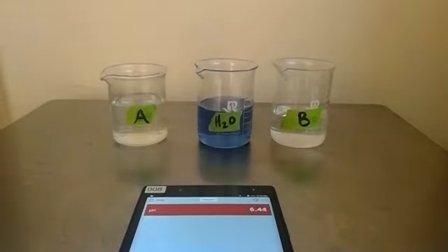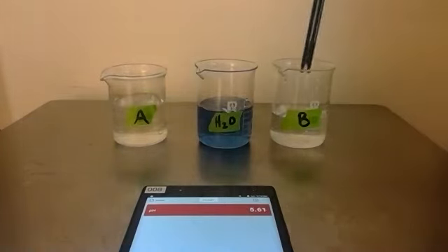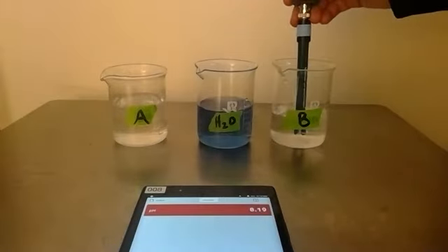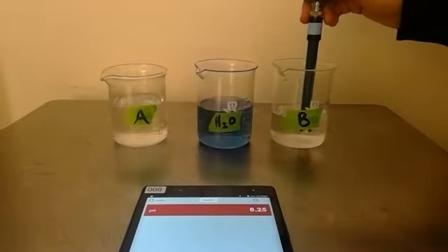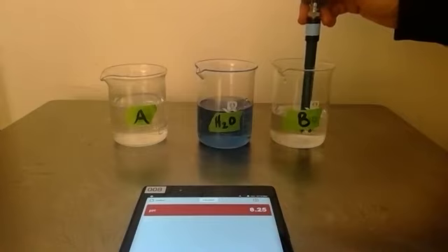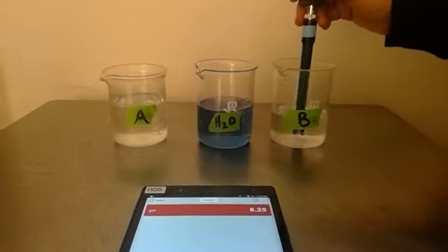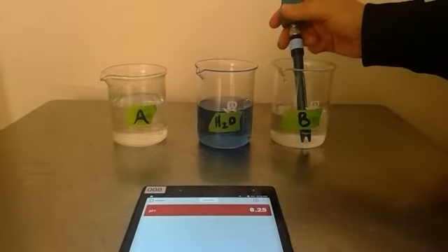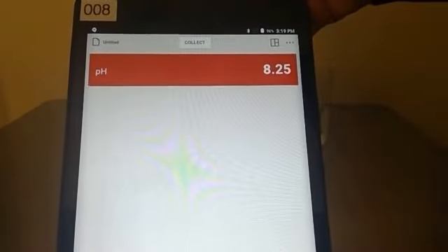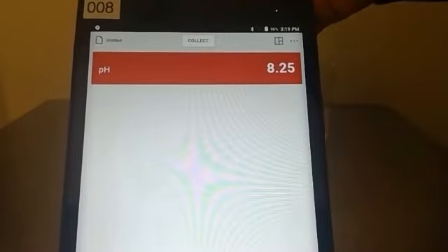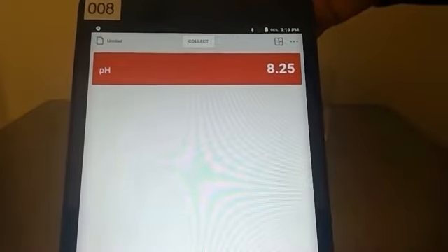Now let's take a look at a basic solution. I've rinsed my probe and dried it off carefully. The probe uses a little glass bulb to measure this. I'm going to stir it up and take the pH. The base that I have in here is sodium bicarbonate, which you probably know as baking soda. It's a weak base and it's trying to stabilize. We can see that it has a pH of 8.25.